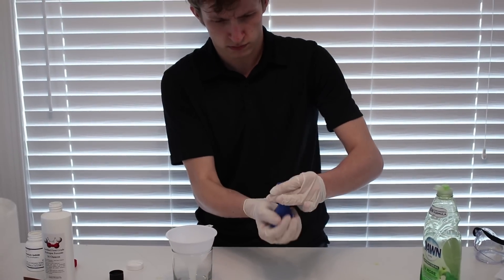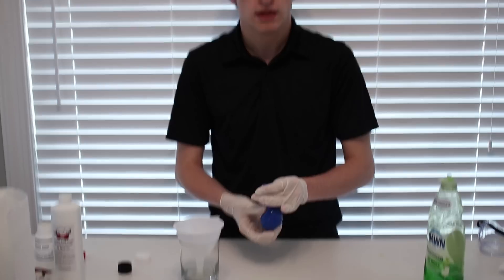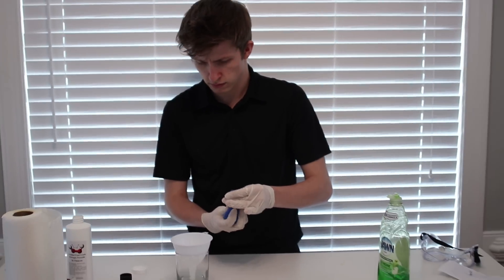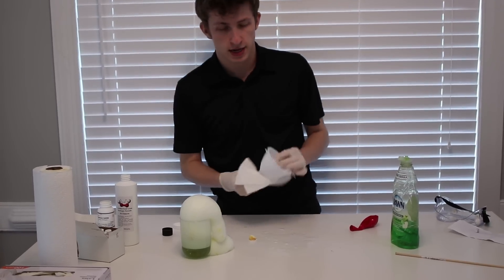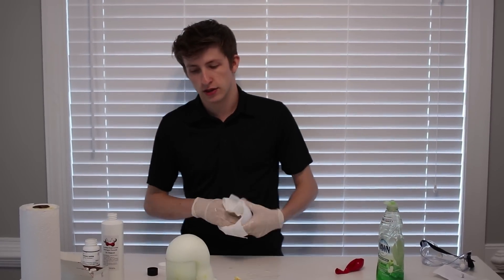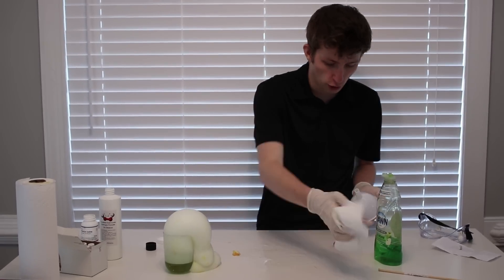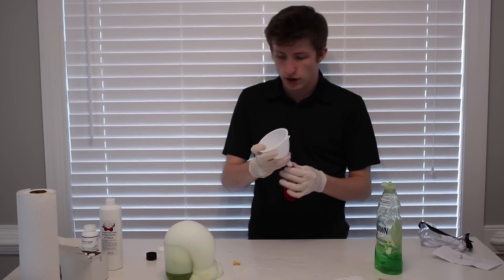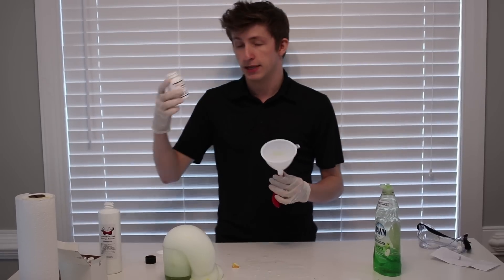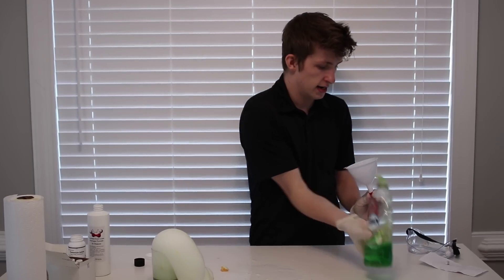Huh. Nothing happened. I wonder why nothing happened. Literally nothing happened. So I think what happened, guys, is pretty safe to say, because now that we took it out, this is what's happening. Once we put so much soap in there, when we poured the hydrogen peroxide into the balloon, it wasn't able to meet with the potassium iodide. So maybe we should put the soap in first, and then the potassium iodide.